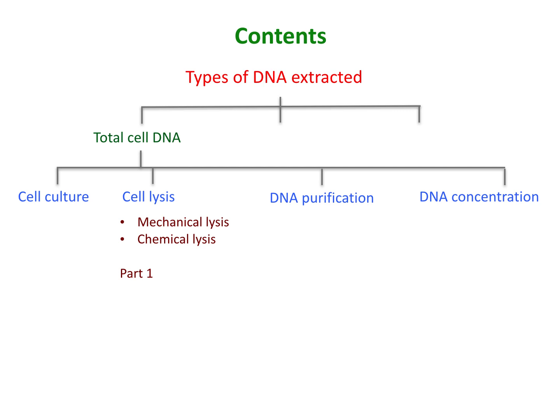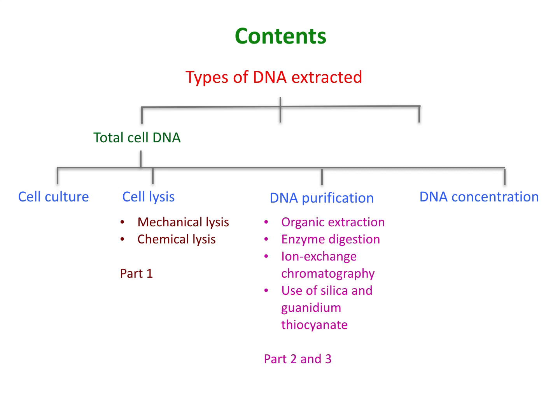I have broadly classified the process of DNA purification into different steps named organic extraction, enzyme digestion, ion exchange chromatography, and use of silica and guanidium thiocyanate. Usually, DNA is concentrated by precipitation with ethanol. All the procedures that I am going to delineate in these videos are very basic and very commonly conducted in laboratories. So please keep in mind that there are other methods as well for DNA extraction that I have not included here for the sake of simplicity.